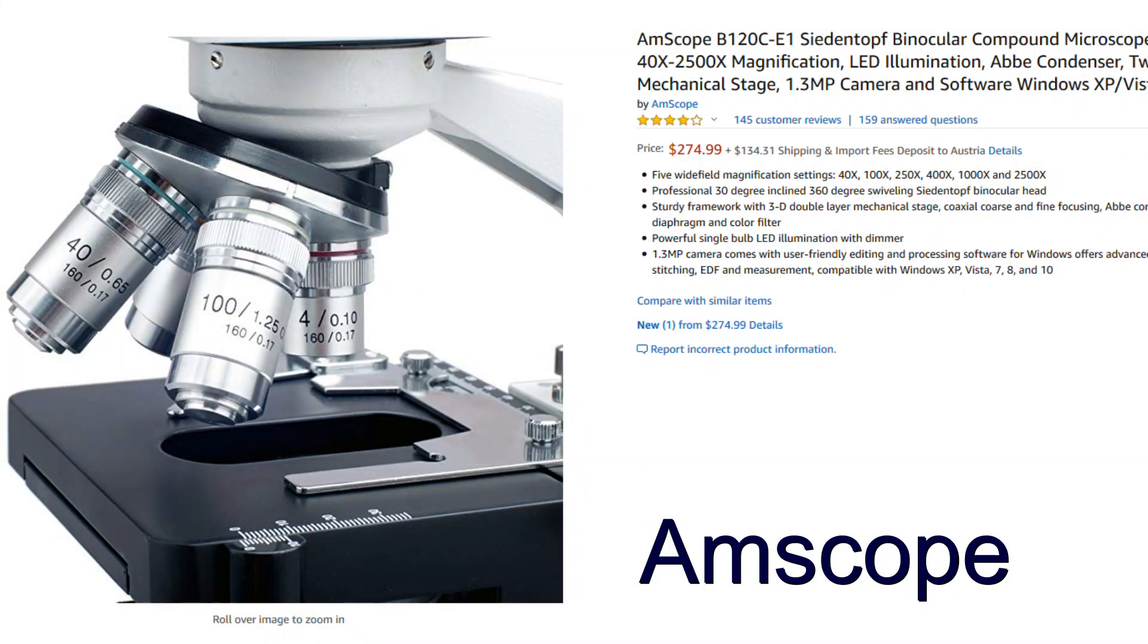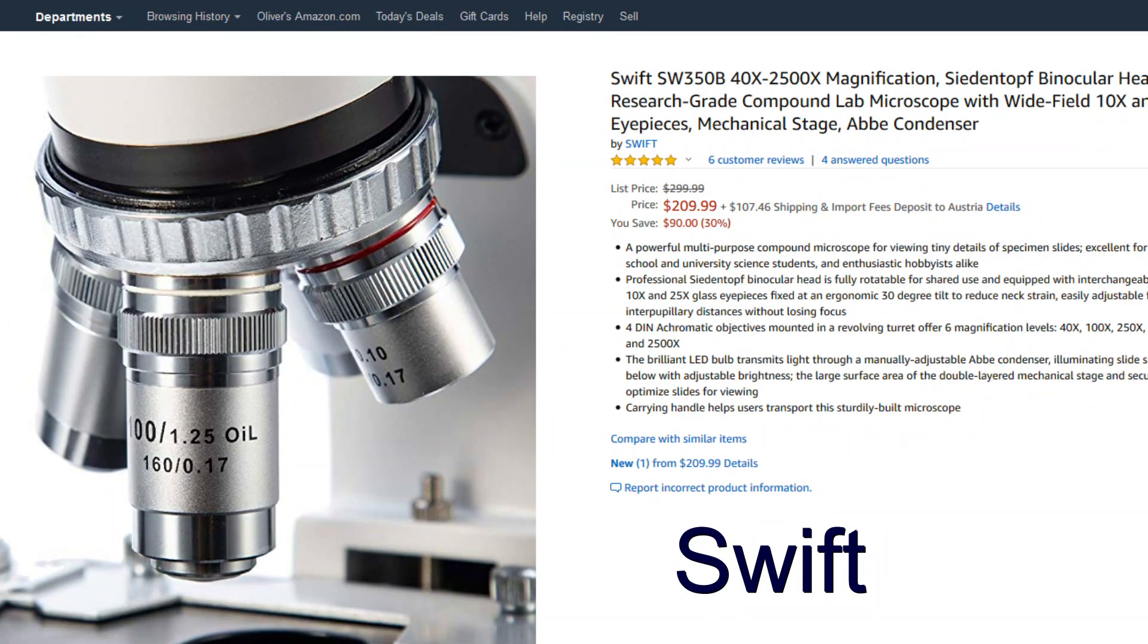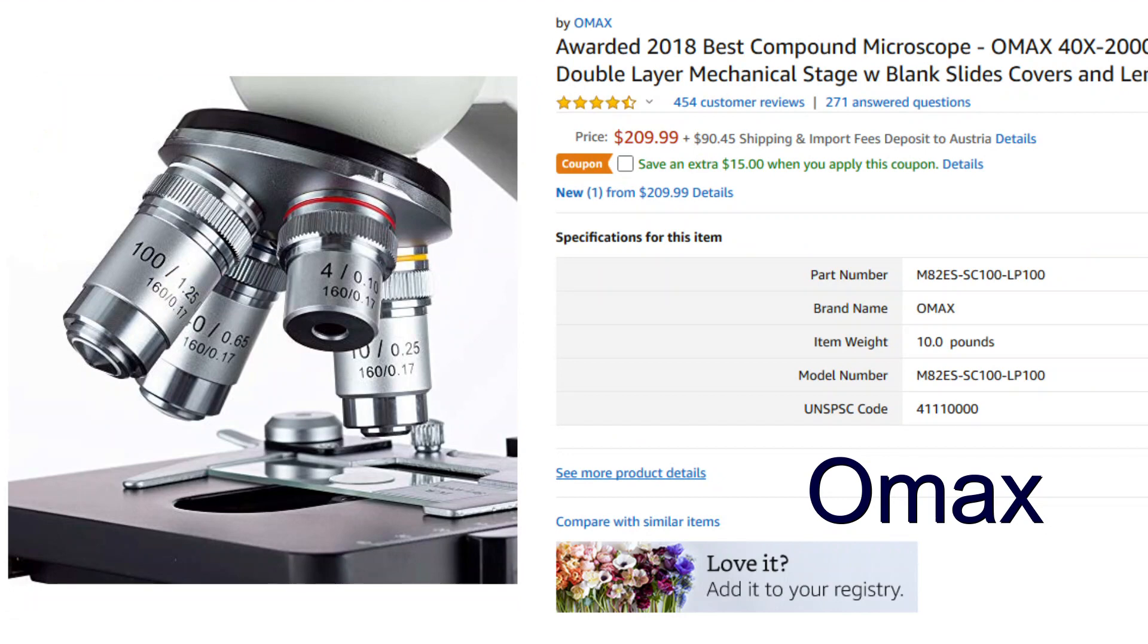And you're probably going to really a high end brand microscope manufacturers and they have their completely separate line of objectives and optics anyway. But at the medium to low end the range basically it's so often like this that these objectives are simply manufactured in bulk and then basically fitted on different types of microscopes that are then rebranded under different names. For example I found the same objectives in Swift, Euromax, PHM, in OMAX, in Amscope and so on.